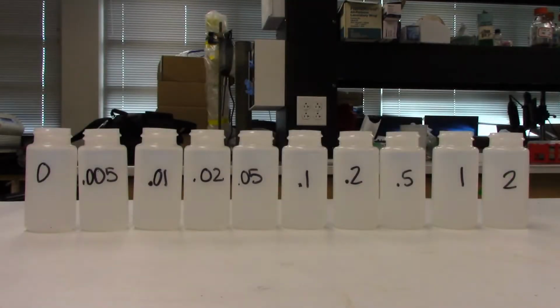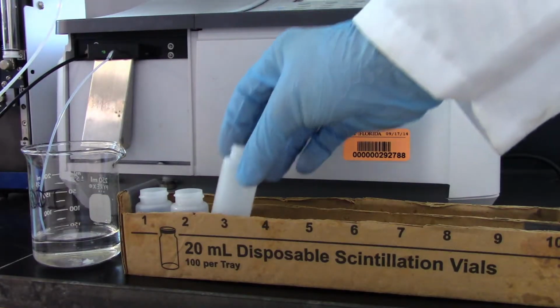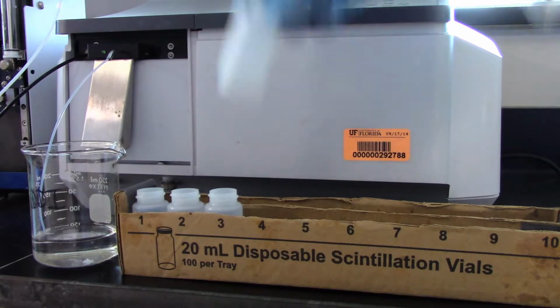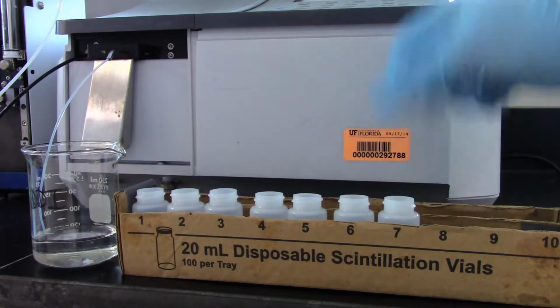Before the analysis, first make sure your samples and standards are appropriately prepared. This process includes, crucially, ensuring that your sample set has a calibration curve that encompasses the expected analyte concentrations, and QA/QCs that ensure the quality of your samples and analysis. Typically, you will need approximately 10 milliliters of combined sample and reagent inside a 20 milliliter scintillation vial. This will allow 2 to 3 sampling attempts by the machine.